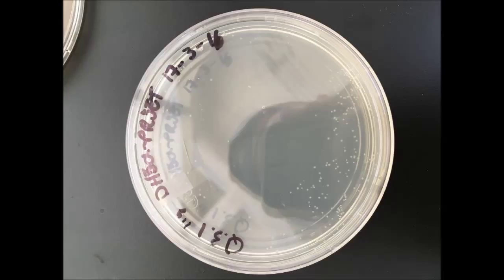All of the CFUs that were observed were white. The low efficiency of the chemically competent cells could have been because they were observed after only 17 hours after they were plated, instead of 24 hours as stated in the protocol.